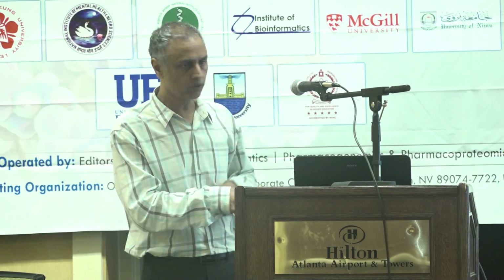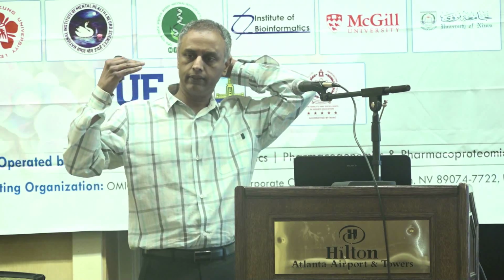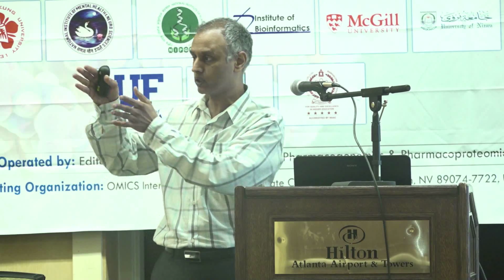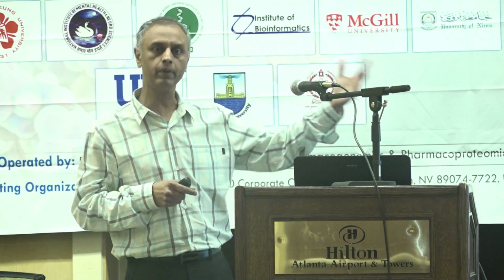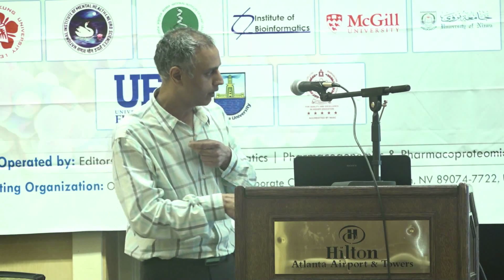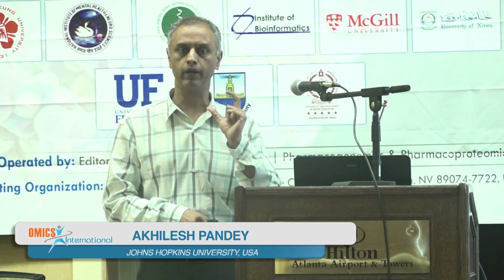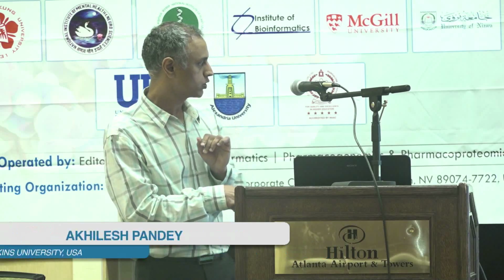So here, 23 is too high for our collaborators. So we really don't know whether it is the technique, it is some handling, some growing in the microbiology lab, where exactly these problems are happening, or it is truly the case that the patients have NTM that are misdiagnosed. So we are not saying they're misdiagnosed. All we say is that the material that we have is non-tuberculous mycobacterium. Okay. Now, we have every sort of problem that you can imagine that we have already encountered in a small set of 100 cases. So just bear with me here.